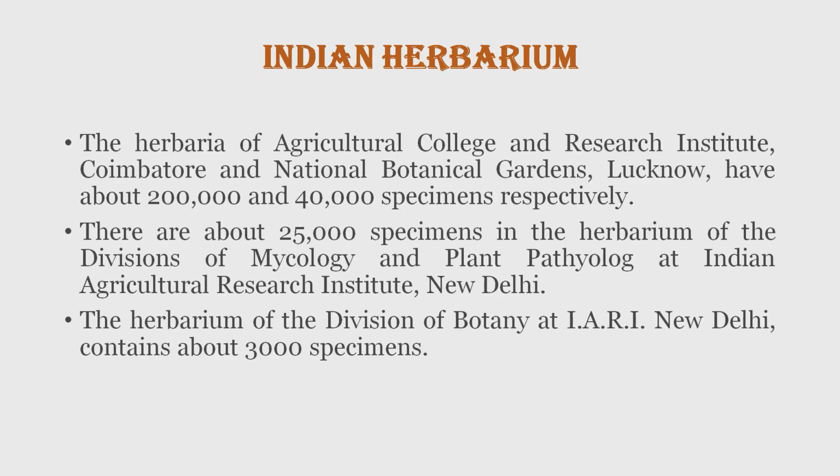So we have studied how a plant can be collected and preserved into a herbarium sheet, how the sheets have to be stored, and how they have to be preserved for a very long time. So they have to be kept in a herbarium. Let me give you two or three herbaria which are present in our country.